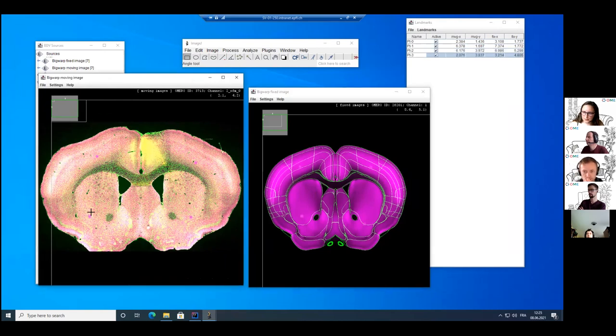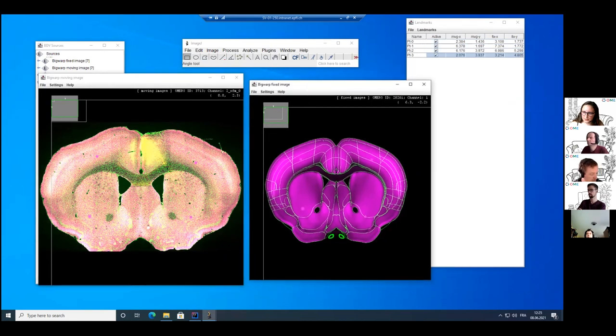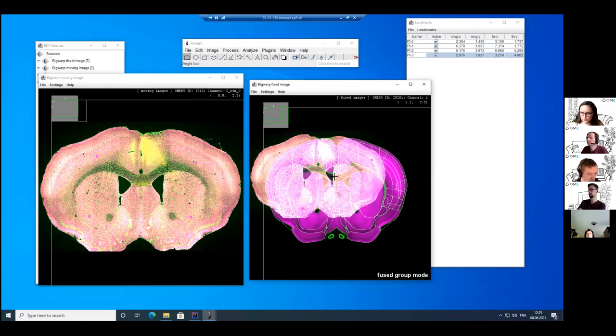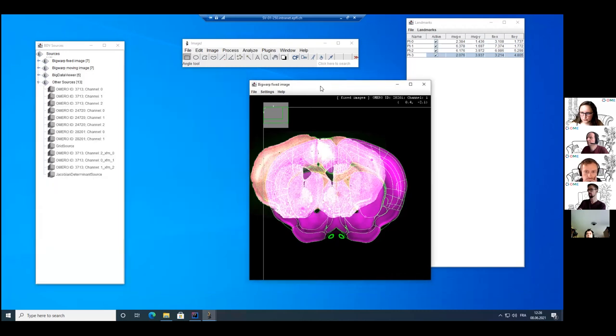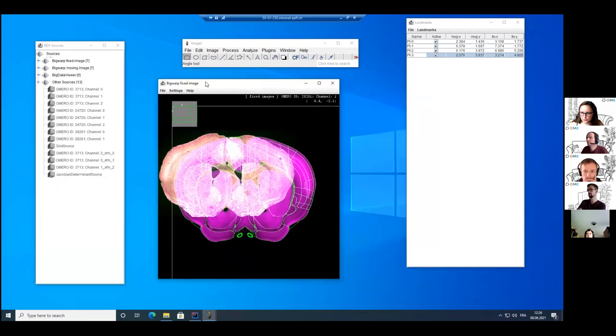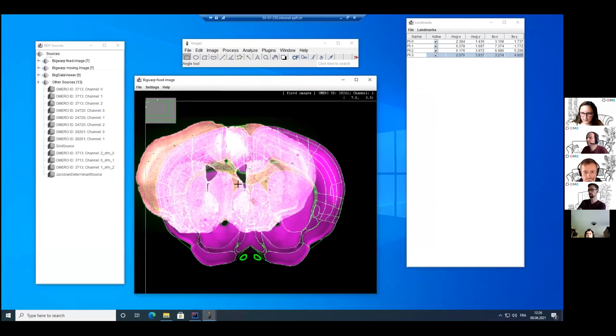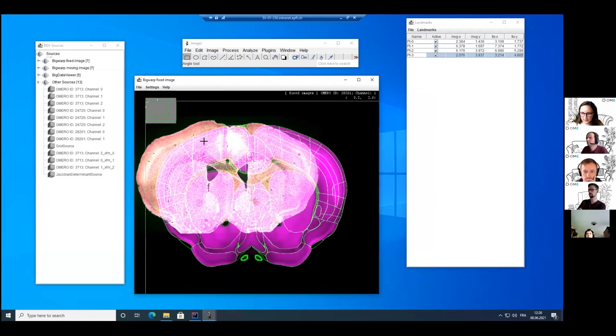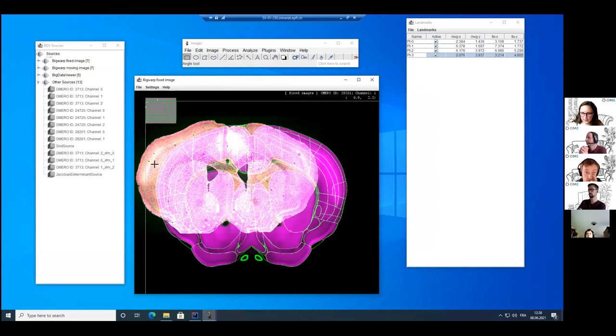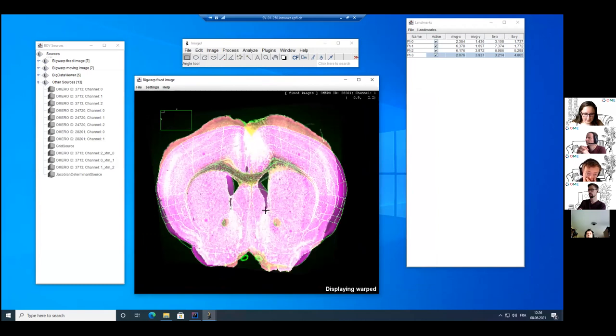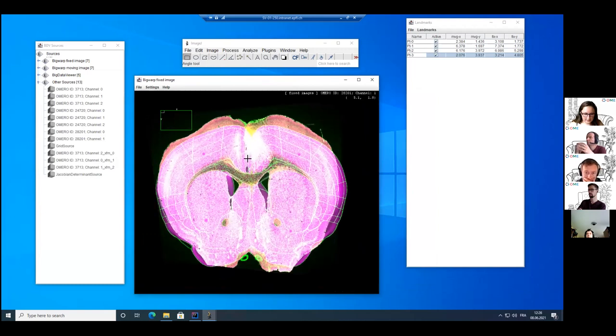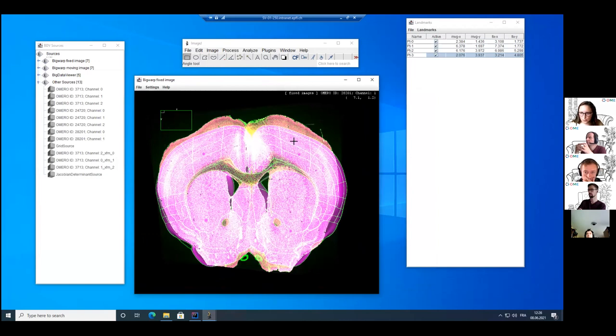So with these four points here, I can go back to my fixed image and I can press F to have the fused mode. So now the two images are overlapping and then I will transform my moving source. So the fluorescent VSI file to the Atlas by pressing T. So now I have transformed roughly my image and I can add more points to fine tune this mapping.